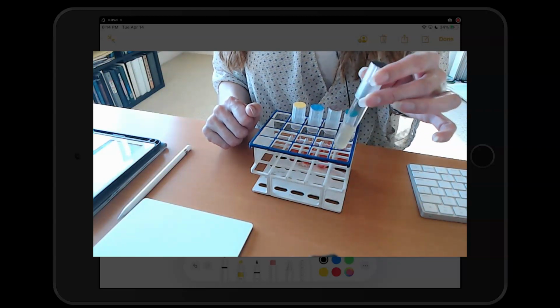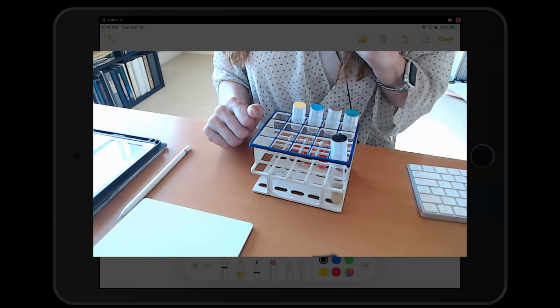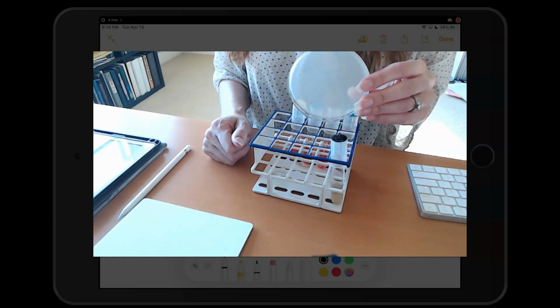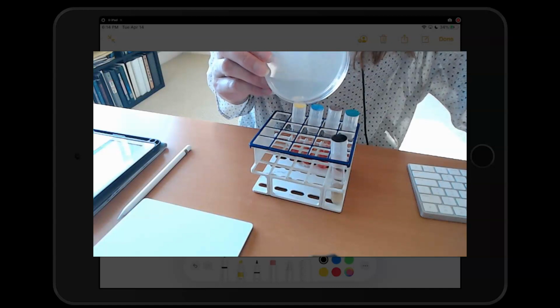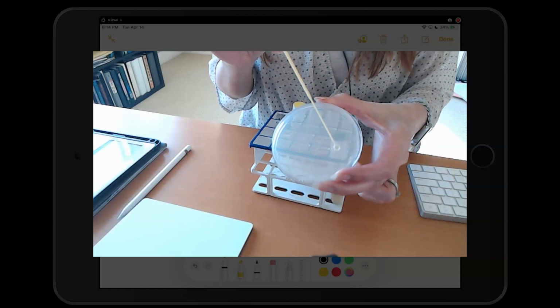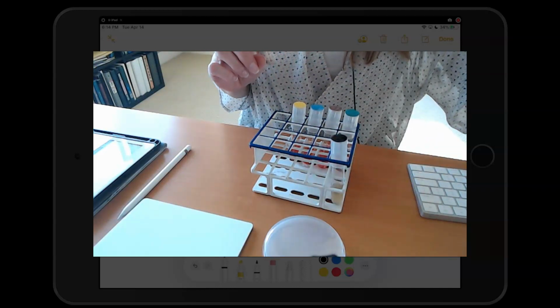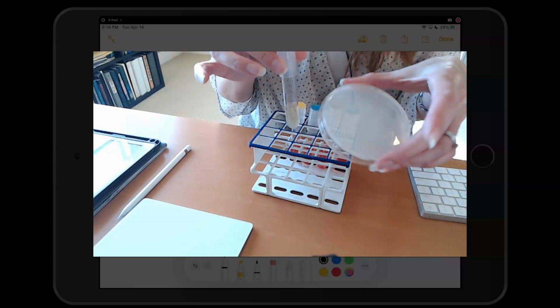Okay, so that's the first experiment for exoenzymes. The second exoenzyme that we're going to be testing for is amylase. Amylase is an enzyme that breaks down starch. So therefore, we're using a starch agar plate. What we'll do is we're going to inoculate two different controls in a straight line, one on one side, the other one on the other side, and we're going to incubate it at 37 degrees for 48 hours. So these are our two tests for exoenzymes: the gelatin and the starch.